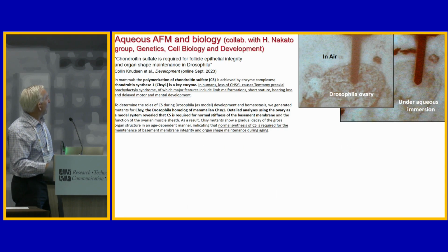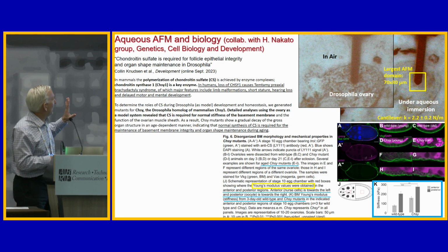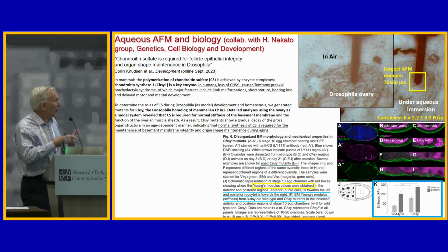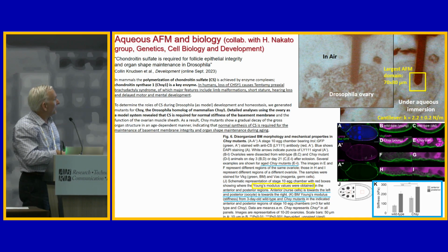Very last, I'm not going to read this stuff, but I had to put this back up here to remind me what was going on in this study. This was published very recently. But we were studying Drosophila ovaries and measuring basically modulus. My biological collaborators refused to call it modulus. They wanted to call it stiffness, so this is from the paper. But it is actually modulus, so we're doing contact mechanics modeling, Hertzian contact mechanics modeling. So basically a three-sided pyramid pushing into these things.